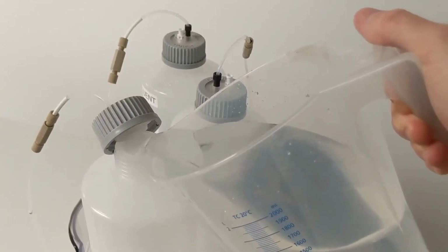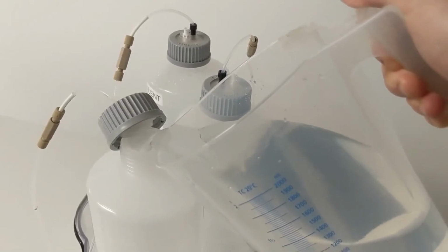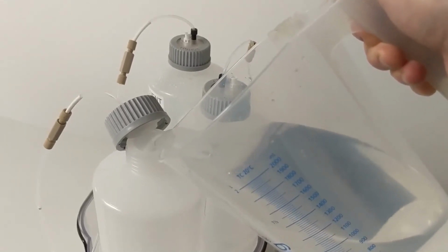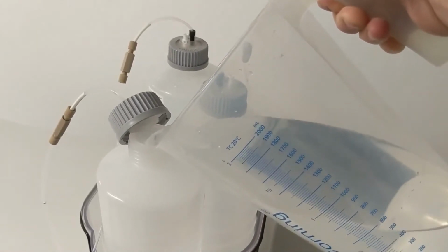When the instrument is running at 1 milliliter per minute, this is very important, you have to fill these up once every 24 hours. So if you do a long run that's going to take 3 or 4 days, you need to come in every day and fill up these bottles. That is key, or else the machine will start drawing air, it'll cancel your run, and it's going to take a ton of time to get the machine back up and running.